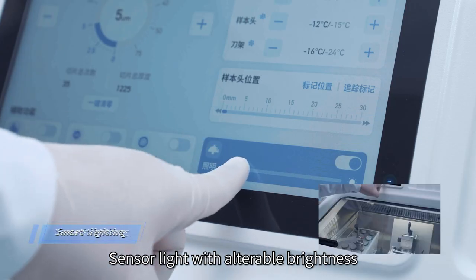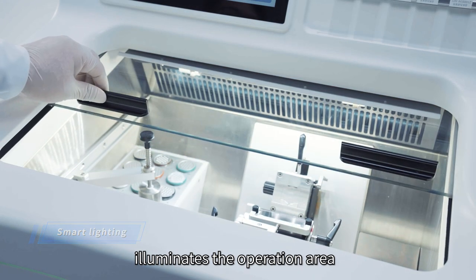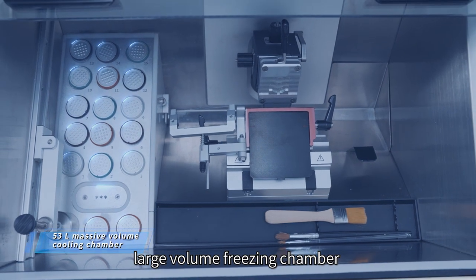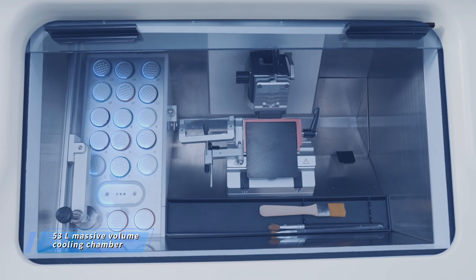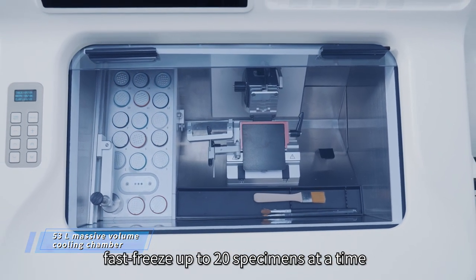Sensor light with adjustable brightness illuminates the operation area. The CT520 has a 53-liter large-volume freezing chamber. The freezing shelf is able to fast-freeze up to 20 specimens at a time.